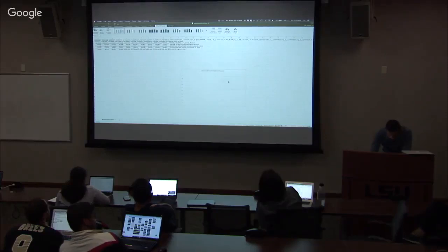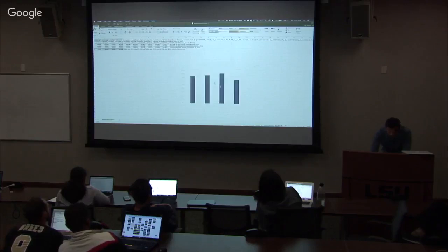Is it possible to access the raw reads? Yeah, you can just open the FASTQ file. That's what you mean, right? So it's available, so you can download that. The FASTQ files are available.